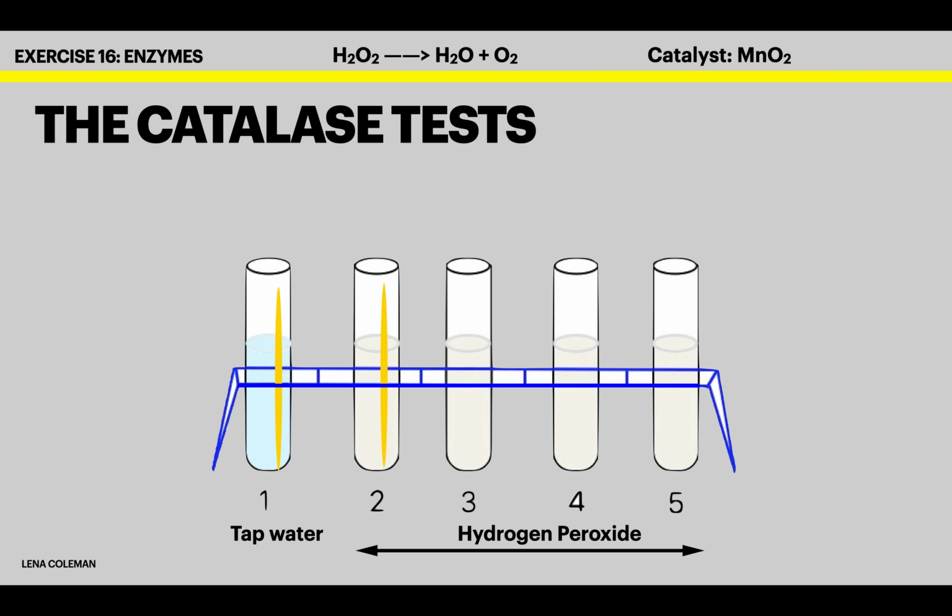Okay, so it seems that the water and the hydrogen peroxide as well seem essentially the same, unchanged compared to before we put the toothpick in. So let's say that has no reaction. Now, let's add a toothpick dipped in manganese dioxide powder here. Okay, so in this case, we're using the catalyst manganese dioxide. Let's dip it into the tap water. Okay, and it appears to be unchanged from what we saw before.